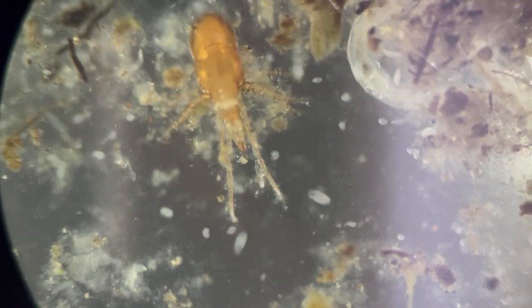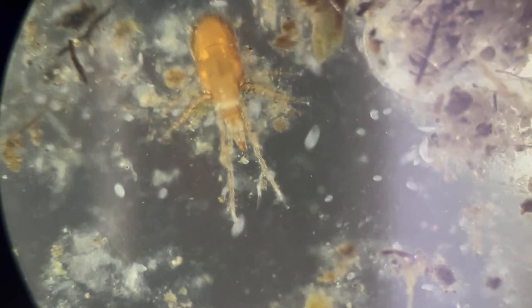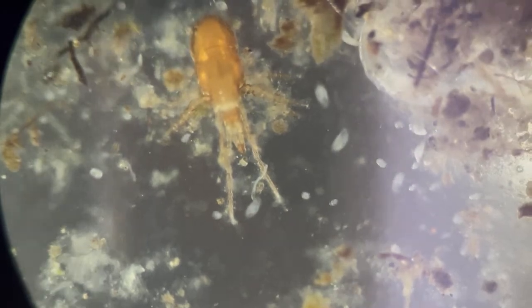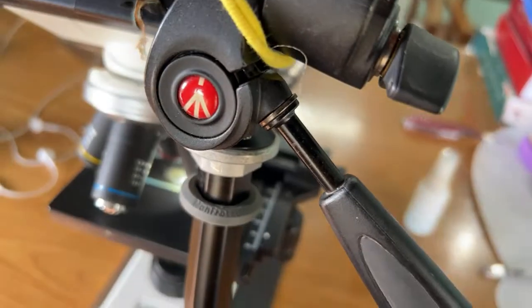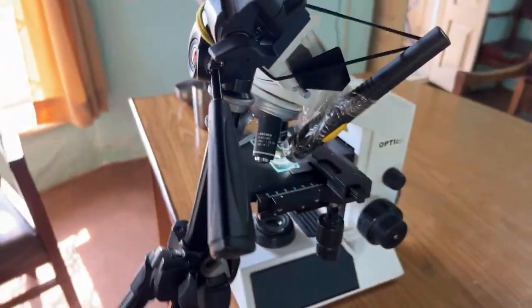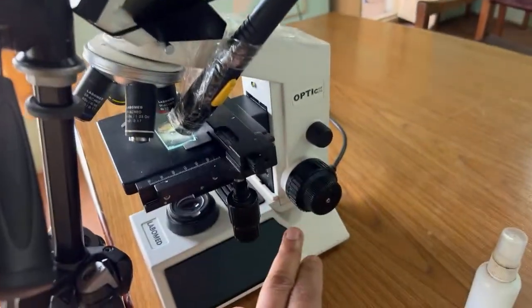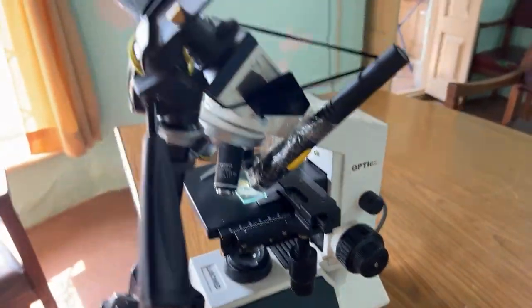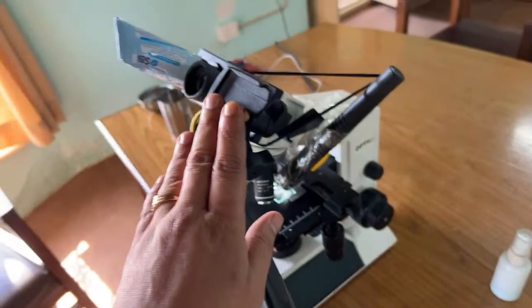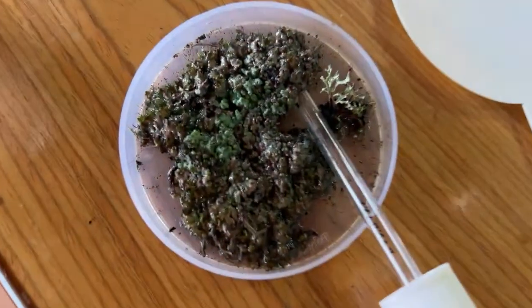So guys, I'll close this telecast, but before I do so, I will reveal what I've been doing. So this was the setup, a normal LED torch on a microscope with the original light source off, and the camera assembly was on this, and this was the sample that we had been observing.